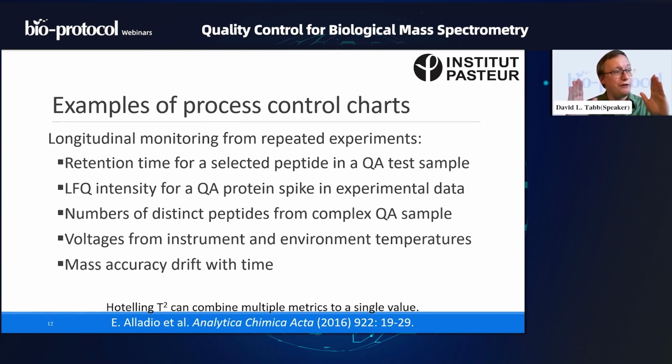Let us say then that for a long period of time, for many months of time, we want to track how this instrument is doing in repeated experiments, usually on a quality control sample, one that has unchanging content. Okay, so if we have particular peptides that we're monitoring in there, we might want to measure the retention times of these peptides that very reliably show up. Those retention times tell us that liquid chromatography is producing very similar gradients of hydrophobicity over time, and that the peptides are eluting right when we expect they should.